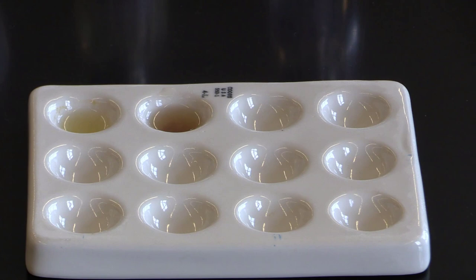As we can see, we have a very pure sample of aspirin that we made because our sample did not change colors.